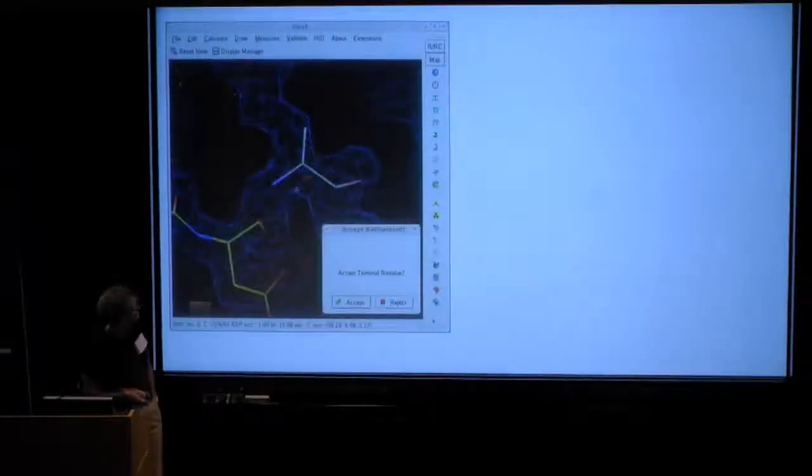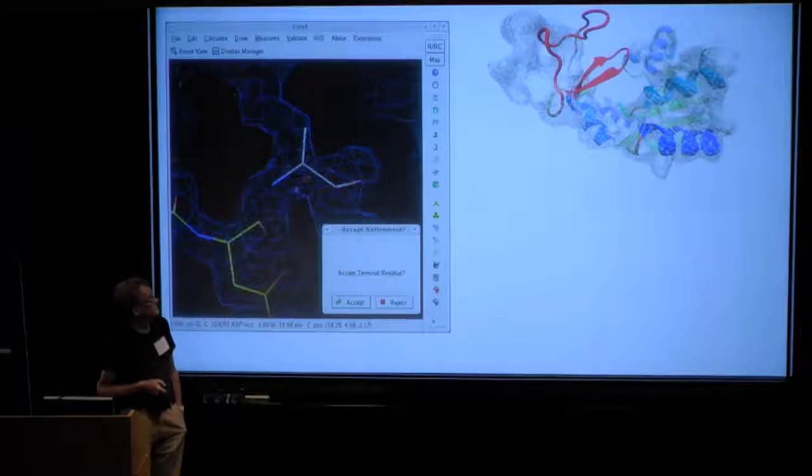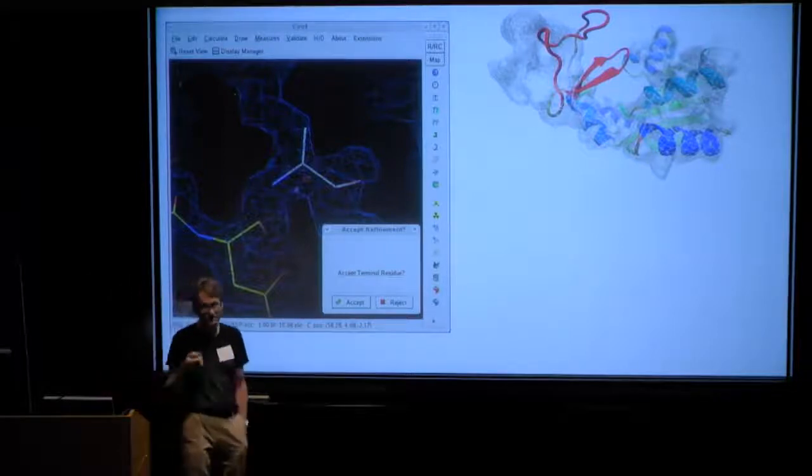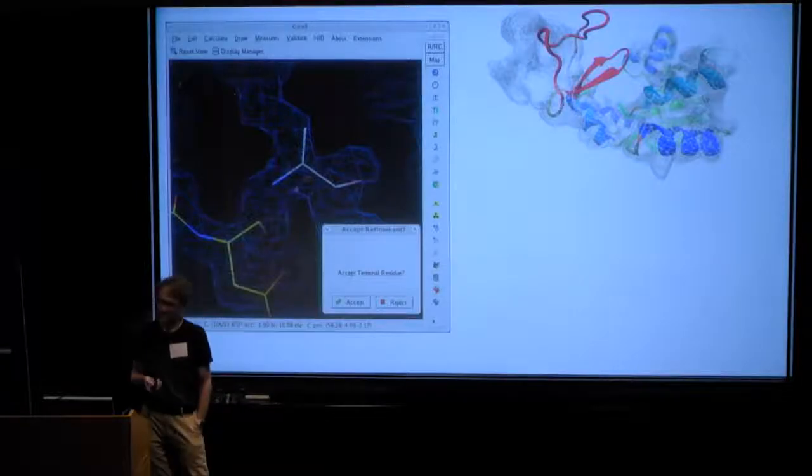So today you would sit down and do this in Coot manually, which kind of works if you're lucky. There are programs that try to do some sort of flexible fitting. MDFF is one of them, and these programs occasionally work. And the occasional part, it depends on the type of motions in your system. So you frequently end up with large distortions, that you're getting secondary structure elements that are completely destroyed and everything.